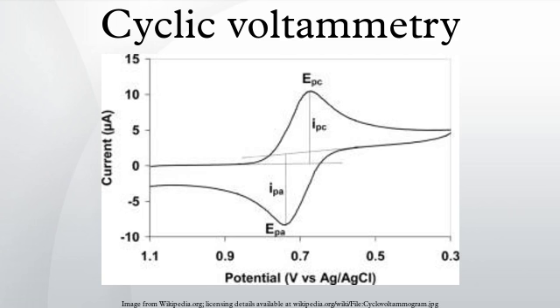While cyclic voltammetry was successfully used to generate currents using the wine samples, the signals were complex and needed an additional extraction stage. It was found that the ET method could successfully analyze wine's antioxidant capacity as it agreed with traditional methods like TEAC, Folin-Ciocalteu, and I280 indexes.